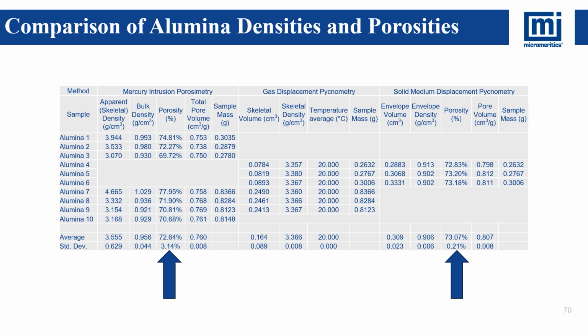Comparing the total pore volumes, there is some difference there. One of the things about mercury intrusion is we very, very carefully determine the intrusion volume based on some very careful measurements of capacitance converted into intrusion volume. So those pore volumes are definitely more reliable than looking at the way a flowing powder packs around the alumina beads. So yeah, there's a little bit of difference there, and in this case the mercury intrusion is the better of the two values for intrusion volume.